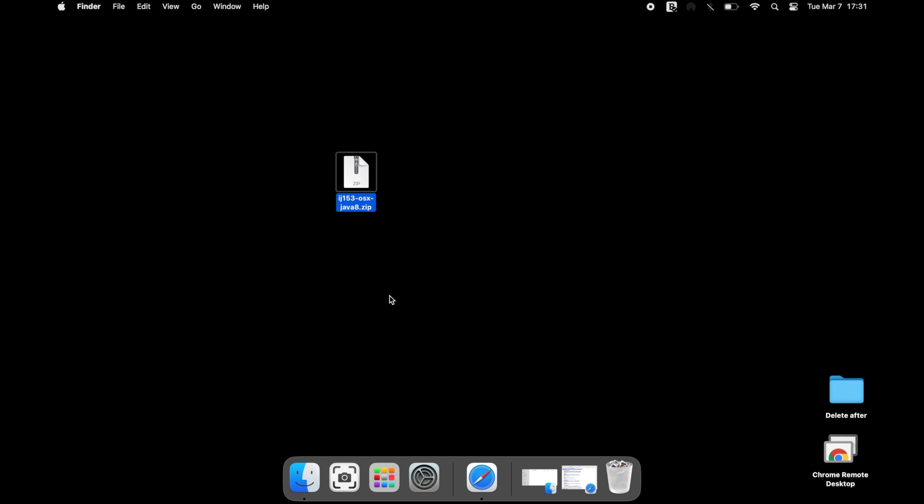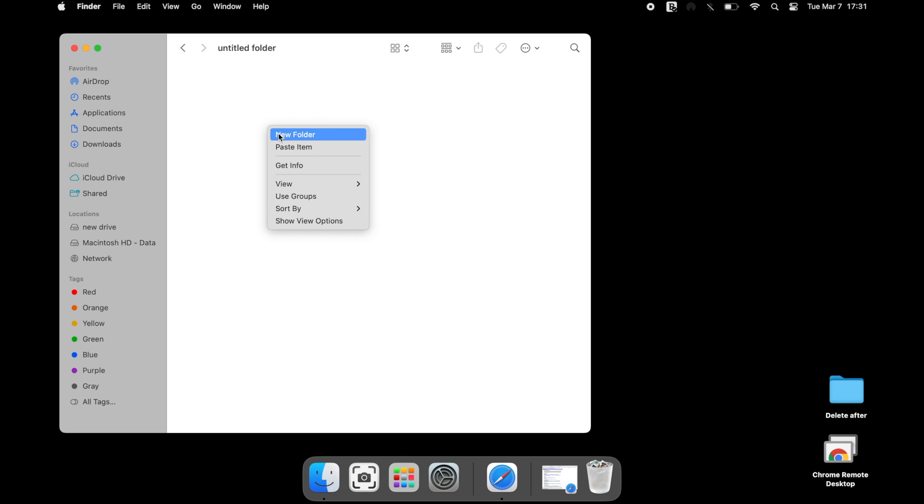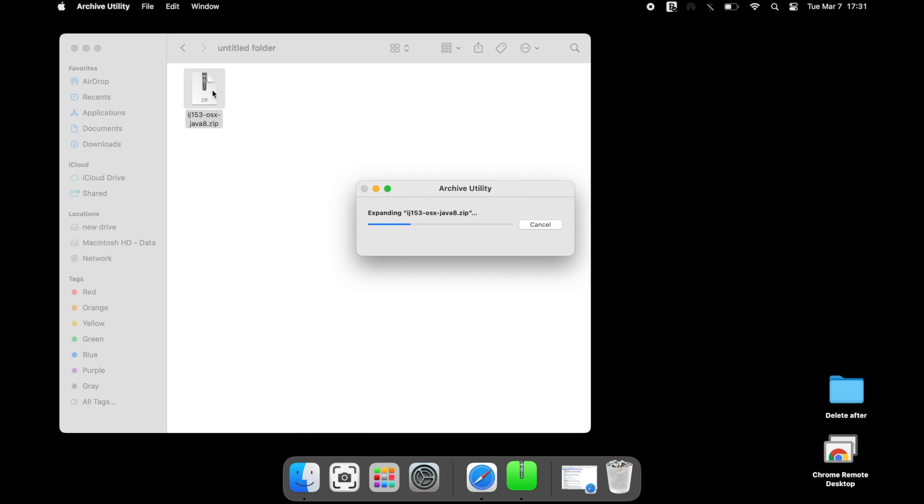ImageJ may or may not function if the location is in the desktop. Using appropriate software, extract the file from the compressed folder.